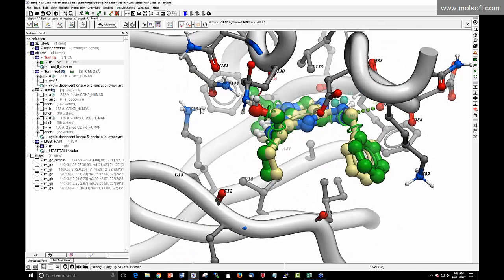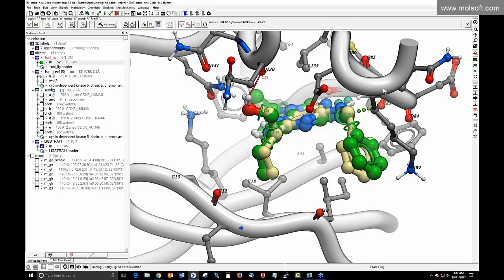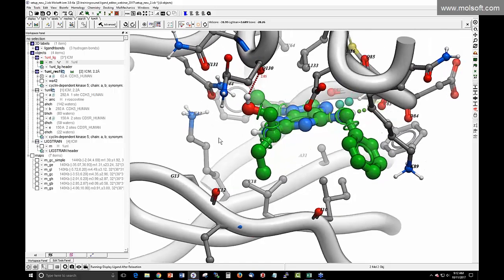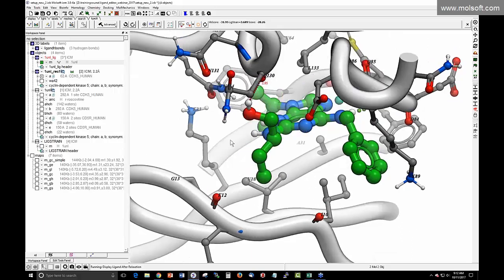This is the energetically favorable conformation of the ligand outside of the pocket. So when you start making modifications, you want to keep an eye on this relaxed ligand. If you deviate too far away, you may start to generate artifacts in the ligand.